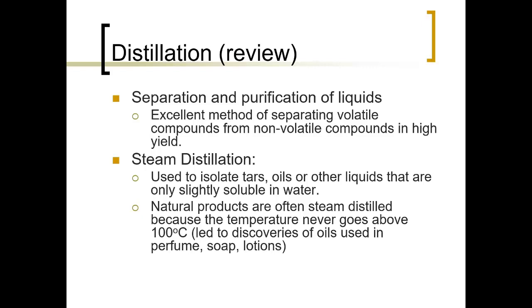They don't separate apart. And the reason is clove oil actually has a much higher boiling point, so it's harder to remove. So by doing steam distillations, we've been able to discover a variety of compounds, but it's also considered mild because we're doing them at 100 degrees Celsius rather than very high temperatures. Higher temperatures oftentimes will cause things to degrade.